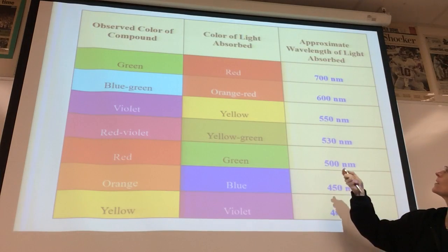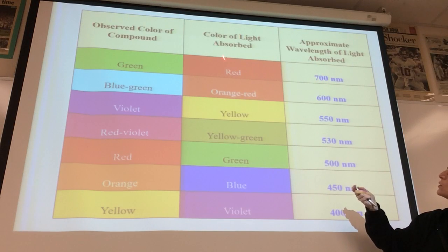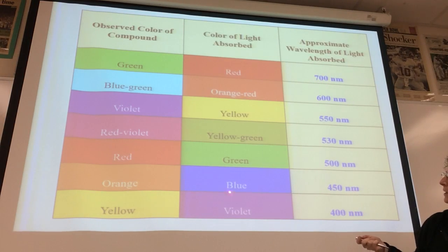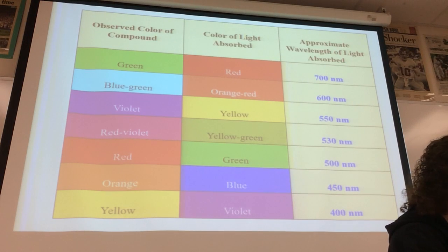And there are the complementary colors there, and again, remember 700 nanometers for that red absorption there. We'll be dealing with the orange-blue as well in the lab, and that's what we'll be setting our spectrophotometers to. We'll have a blue filter.